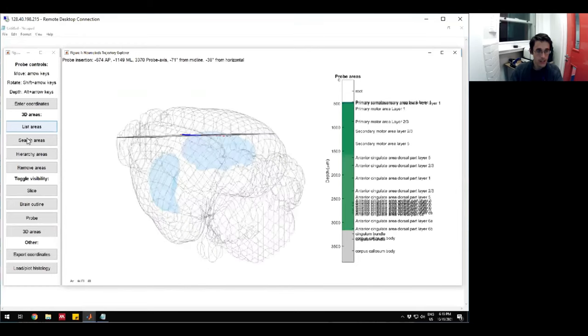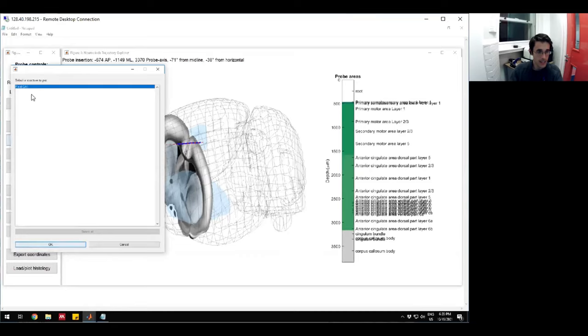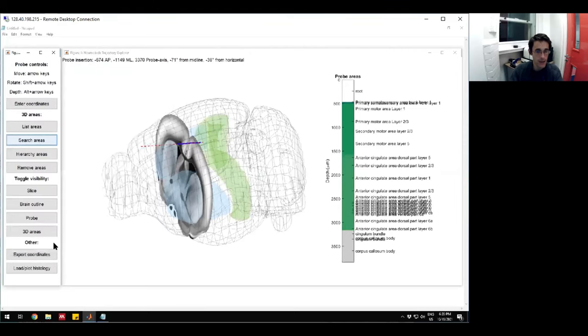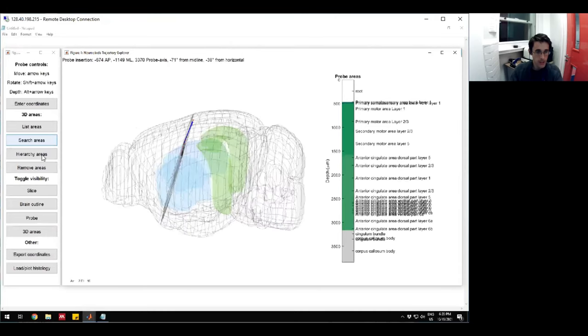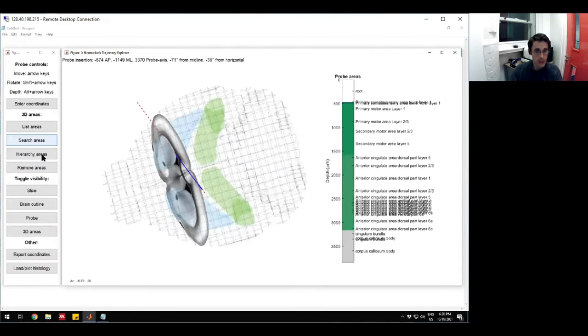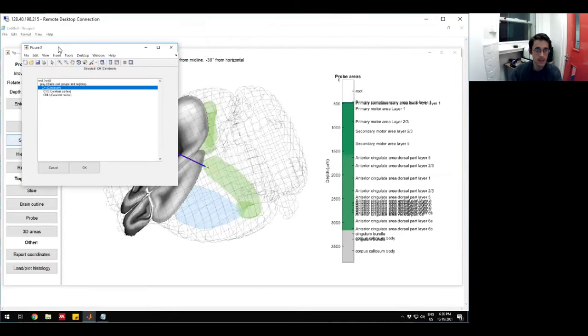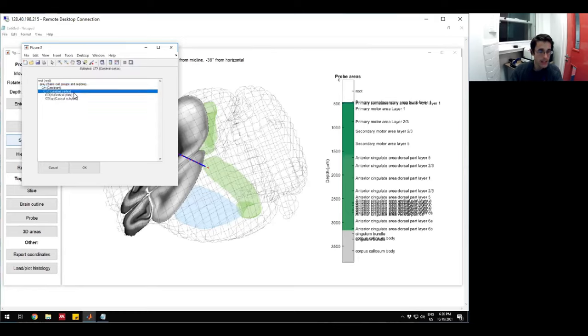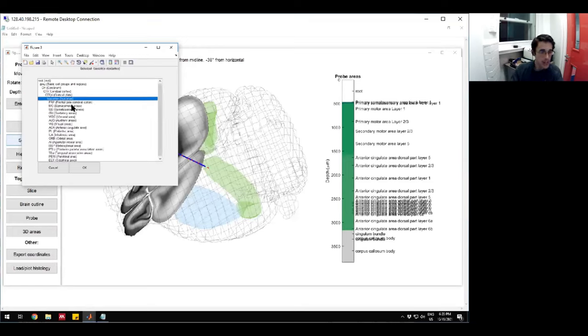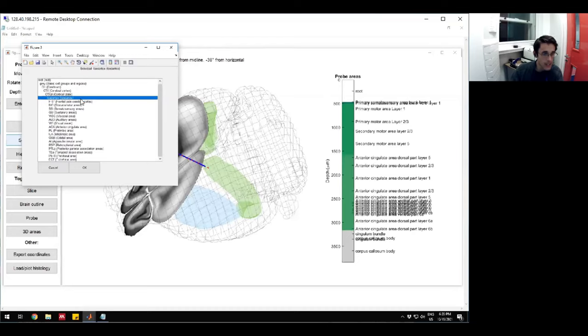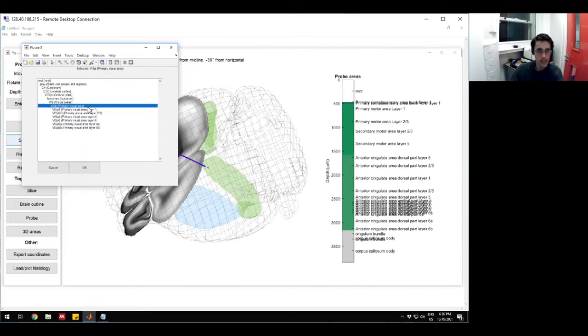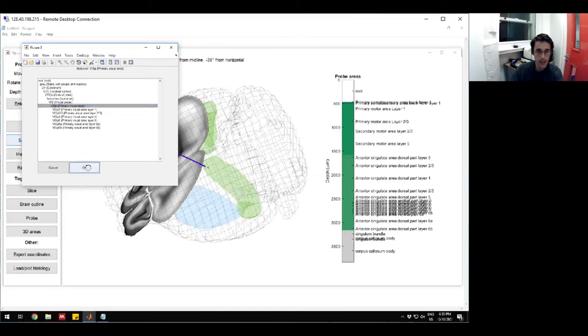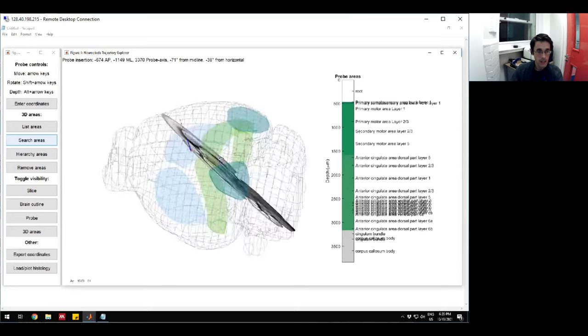We can also search areas. Let's say I'm interested in CA1, but I don't know exactly what the Allen Institute calls it. I can just type in CA1. I see here there's a thing called field CA1. That's what the CCF calls CA1. I can hit okay, and then it will draw CA1 for me. We can also look at hierarchy areas. This is useful if we want to look at a location which is parsed into smaller things, but all together. An example of that is cortical layers. Let's say I want to show all of the visual cortex, but I don't want to break it down by layers. I can go here and drill down cortex, cortical plate, isocortex, and then visual areas. The Allen goes down into the individual layers. If I want to see all of the visual cortex at the same time, I can just select this layer, hit okay. Then it'll draw this big blob of the visual cortex.